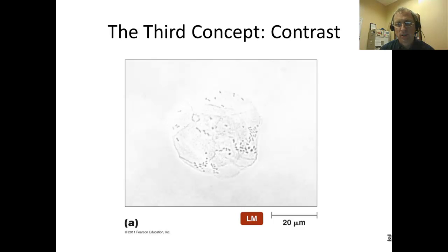The drawback of this approach, however, is that by treating cells with chemicals to increase contrast, we're typically going to be dealing with dead cells after this process. Consequently, if our experimental goal is to be able to recover living samples after looking at them under the microscope, this might not be the best choice.